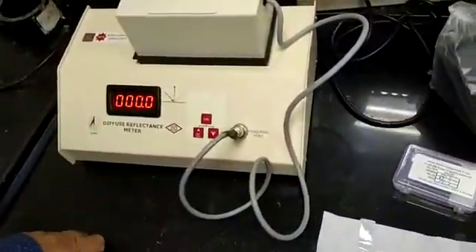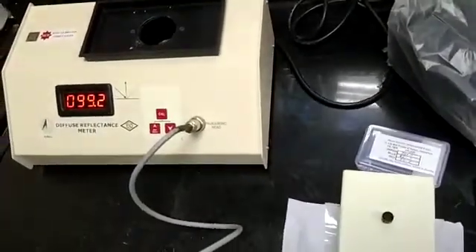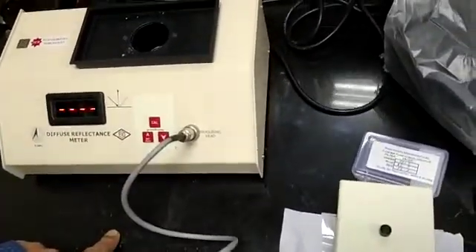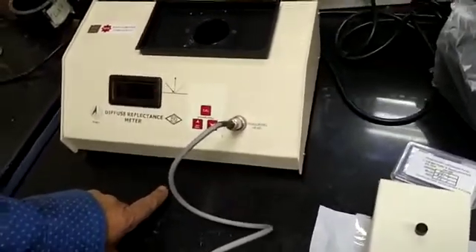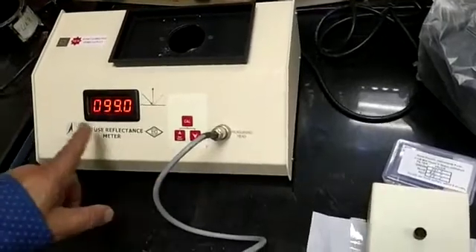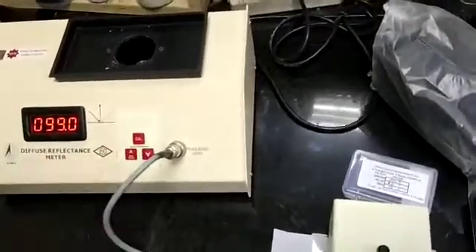Then place this head on zero. This is zero. Then again on the MG block. In case there is an error, you can remove it. Press cal. This is 99. Remove the blinking with the help of this cal button. Blinking stops.